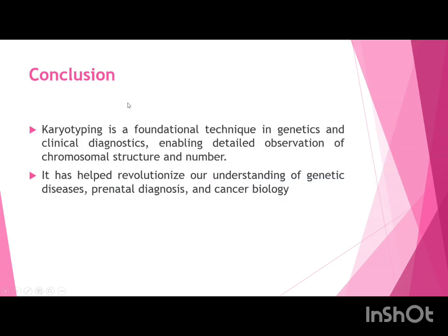So finally, we can conclude that karyotyping is a foundational technique in genetics and clinical diagnosis. You have understood well that it is an important part of medical science as well as of evolution also. If we have identified anything which is new to us, we can go for evolutionary diagnosis also.